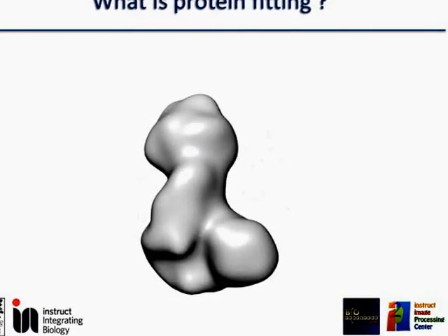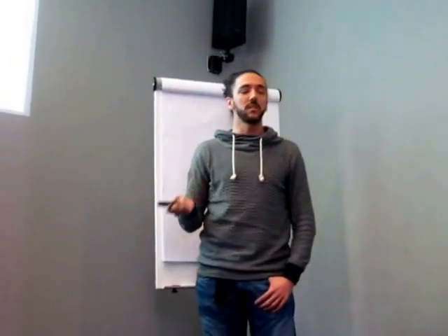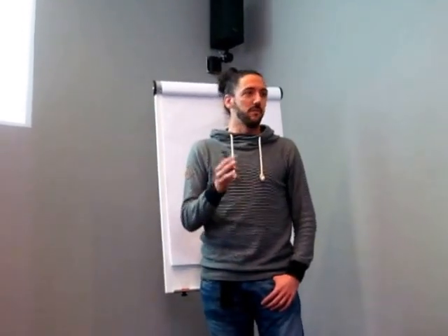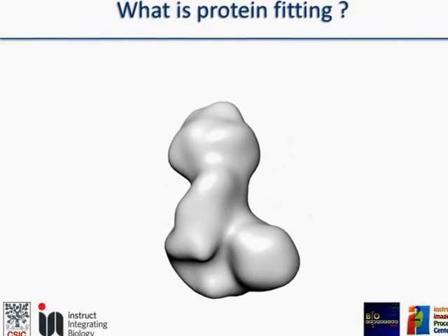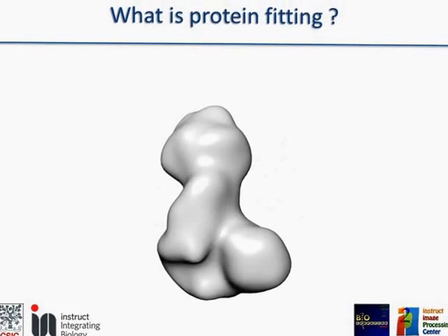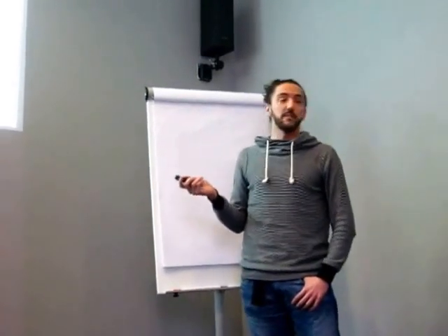I think now it's quite clear for everyone what protein fitting is. But maybe if we go back 5-10 years ago, the words fitting and docking were used for both processes. But let's explain this with this example. Here we have a 16 Angstrom resolution map. This is what most probably we will get after preparing our samples, going to the microscope, analyzing all the images, and finally to the three-dimensional reconstruction.